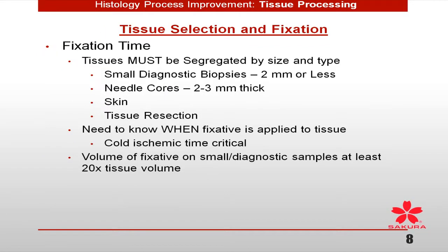All of those instruments that we just talked about have a requirement of tissue sample selection in being placed into that processor. Not to offend anybody out there, but I do have a term: if you're putting all of your different size types of tissues all onto one process at the end of the day and running it to come off in the morning, you're kind of doing Goldilocks and the Three Bears processing in today's laboratory.